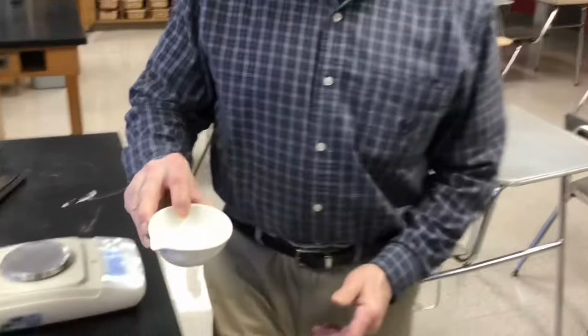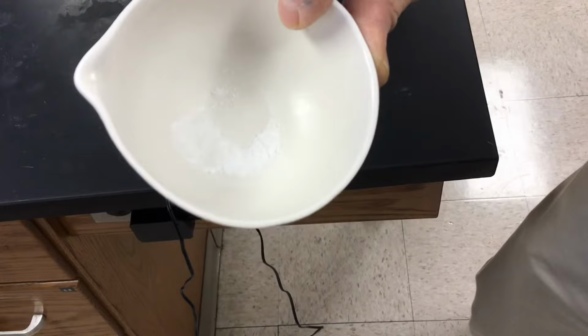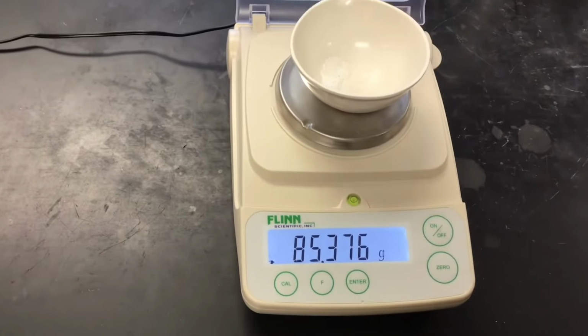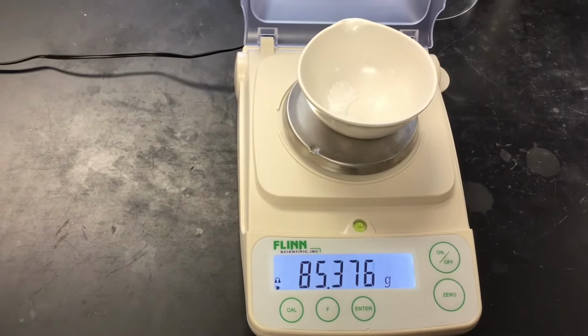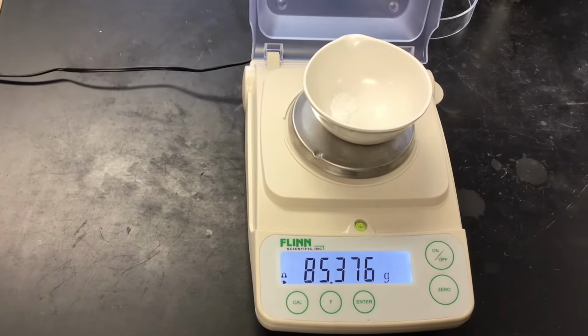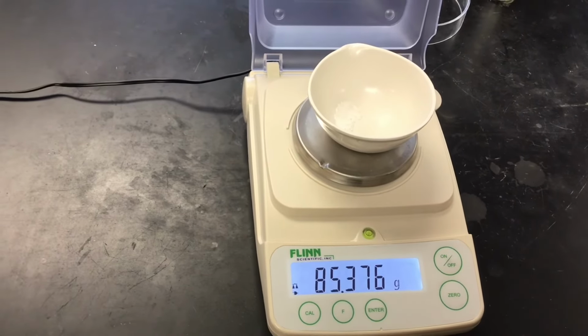Okay. So now we have let the potassium chloride cool off. Yep, I don't know if you can see before, that white substance in there is potassium chloride, and that's what's left when the oxygen is driven out. So now we need the mass of the dish and the potassium chloride. Yeah, so this mass has the evaporating dish and the potassium chloride. What are you going to do with that so you can just get the mass of the potassium chloride? Okay, and from this, I think we can calculate the percent that oxygen made up of potassium chlorate. That's right. Good luck.